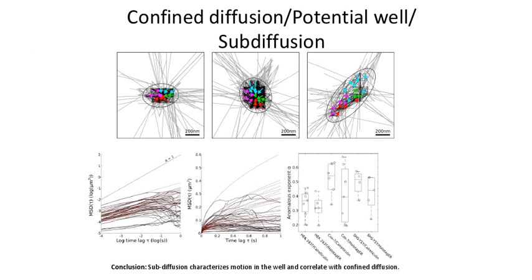So this is a very strong characterization of this region of high density. And so to confirm, or to have another possibility to explain this region of high confinement, we use what is called the classical MSD analysis, which is basically we calculate the difference between t and t plus delta t over the trajectories. So you can calculate this difference squared.